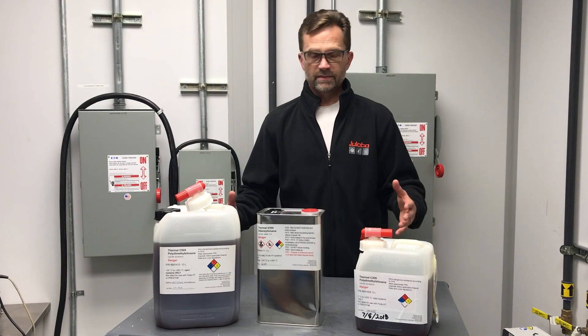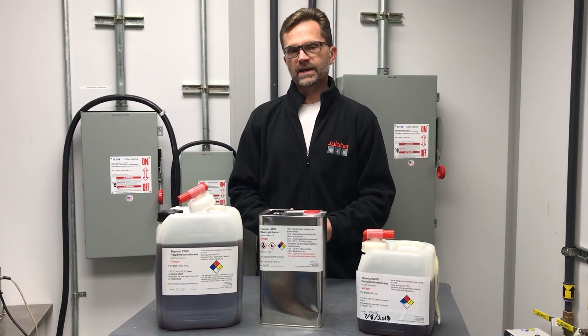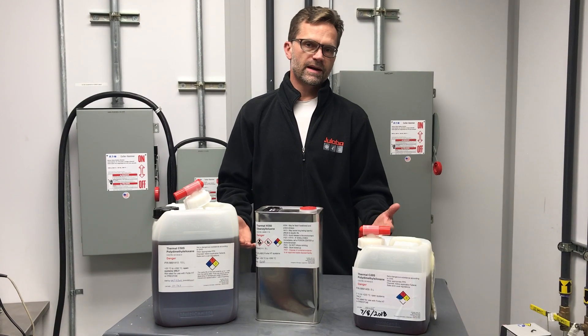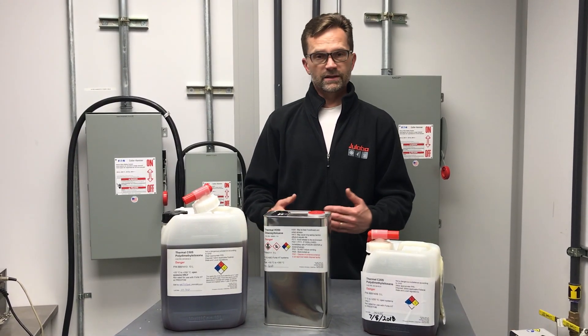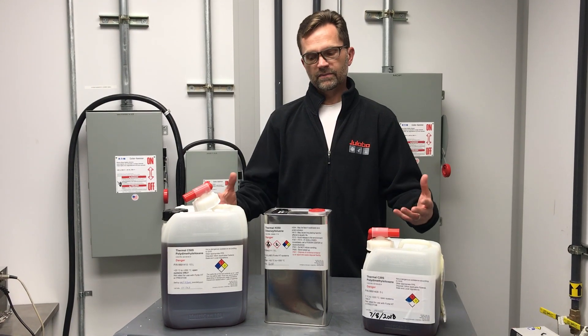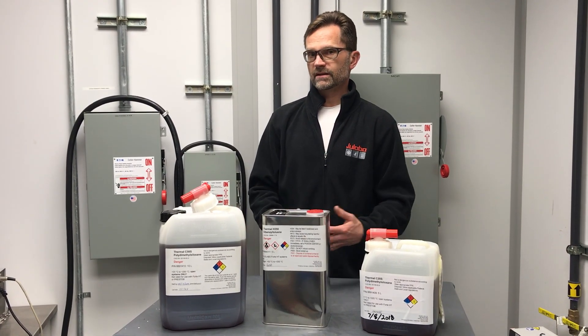Ultimate fluid lifetime will depend upon your application. So if you are operating at high temperatures, make sure that you inspect at regular intervals to check for oxidation, viscosity increase, and then replace the fluid accordingly.